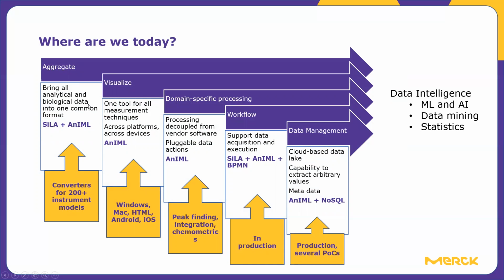Now, once I have that data in one common format, one thing that is low-hanging fruit is to then build visualization technology on top of that, which means I can use a single tool for all my measurement techniques across platforms and across devices.